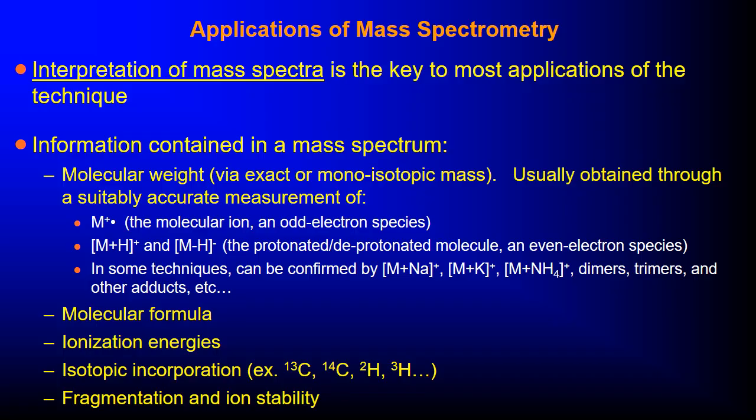Molecular formula can also be obtained from the mass spectrum. Ionization energies can also be obtained. Isotopic incorporation, fragmentation, and ion stability.